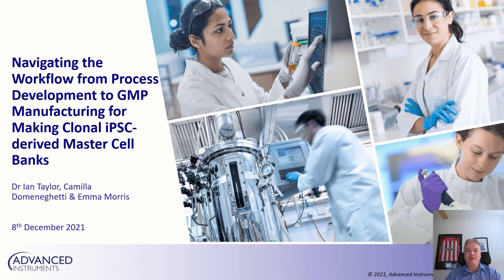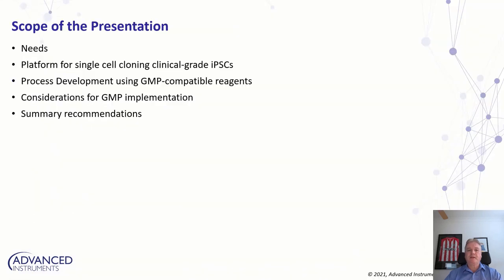I'm going to talk to you about today. In terms of the scope of the presentation, I'm going to begin with pointing out some of the needs of the equipment in this area. I'm then going to go through the details of our particular platform from Solentum for single-cell cloning of clinical grade iPSCs. We're then going to go through process development using GMP compatible reagents.